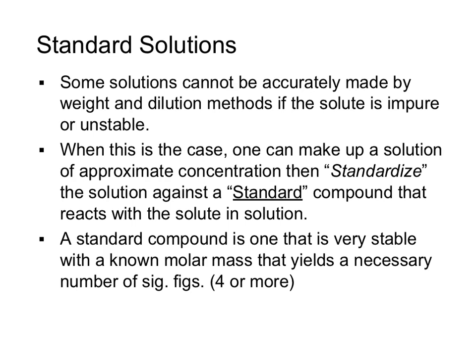The standard compound is one that is incredibly stable with a known molar mass and has at least 4 or more significant figures in that molar mass. This allows us to be very exact.